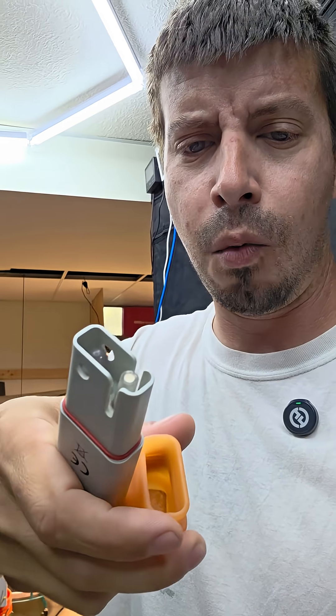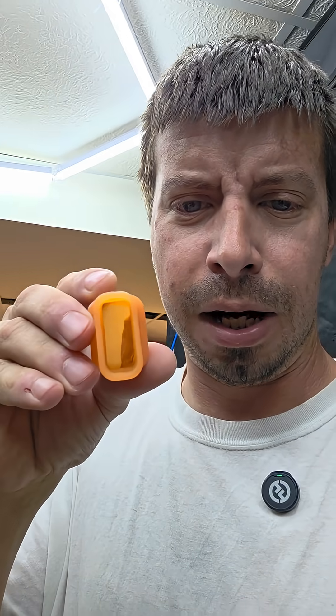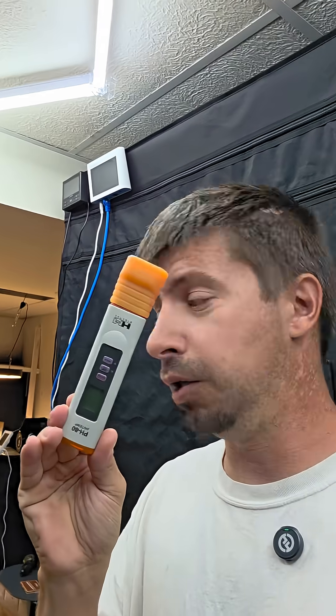A lot of these types of meters have like this little probe down there — that white piece in there, it's like a material and they don't want it to dry out. You end up having a cap with a storage solution and a little sponge inside, and that's supposed to keep the probe wet. But drying it out makes the thing go bad. I'm pretty sure I never let either one of these dry out and they still went bad within a month or two.